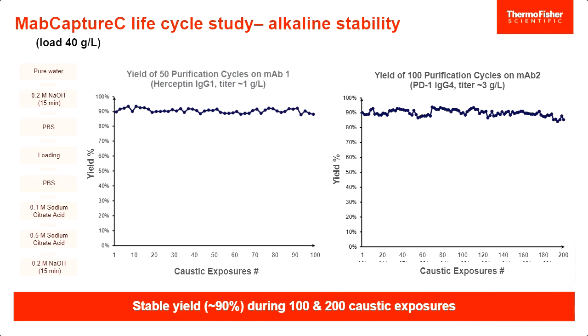This included 2 15-minute sodium hydroxide cycles each. And for simplicity, as you can see on the left-hand side of our study, the run outline and the run conditions, we used common buffers like citric acid and PBS that are also available as pre-made buffers, what Carlos mentioned previously.